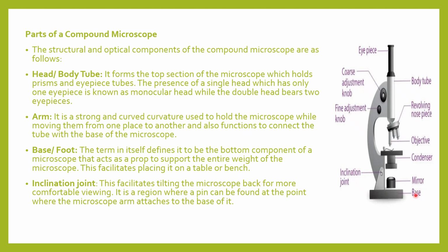So yes, this is the base as you can see here, and this is a component which is required as a support. Okay, this gives the support and this helps the microscope to be placed on a particular bench or table or any other floor.